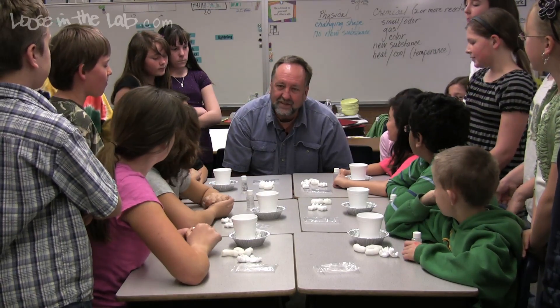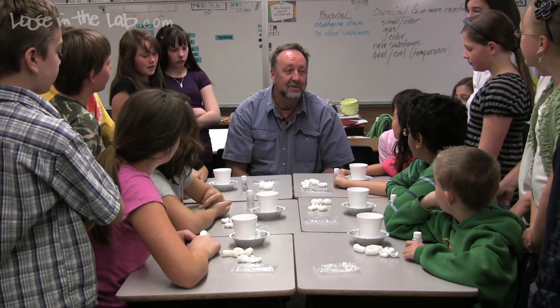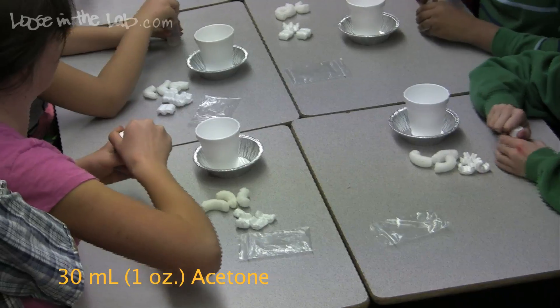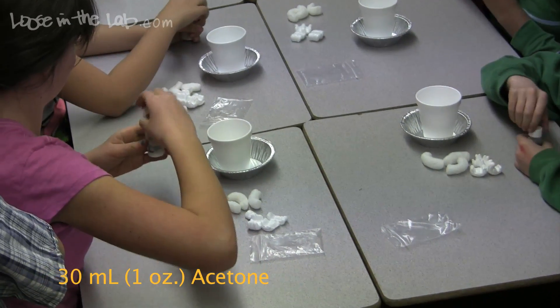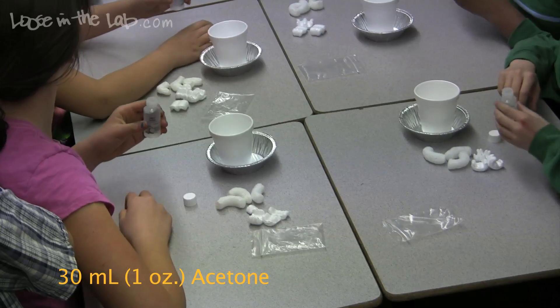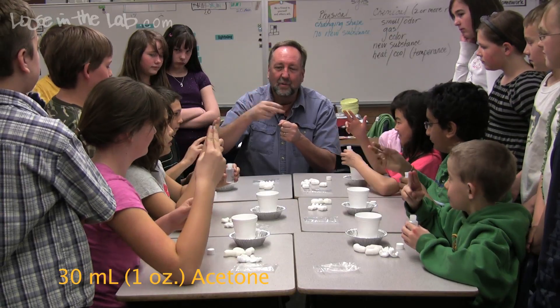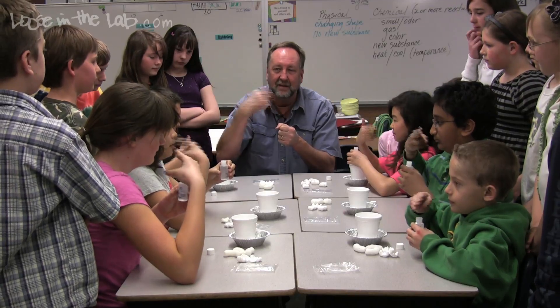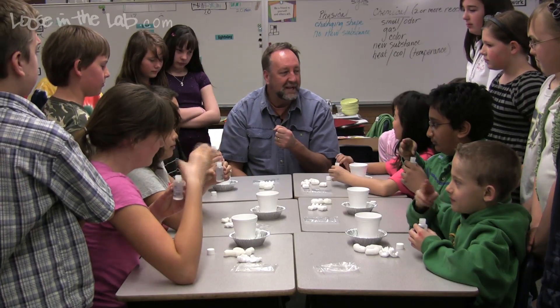The activity today is about physical changes. The first thing we're going to do is learn how to smell chemicals properly. Remove the cap from your bottle, hold it out in front of you about six to eight inches, get your Cub Scout sign out, and waft some of the chemical in here. Tell me what this chemical is made out of. What does this smell remind you of, Mia?